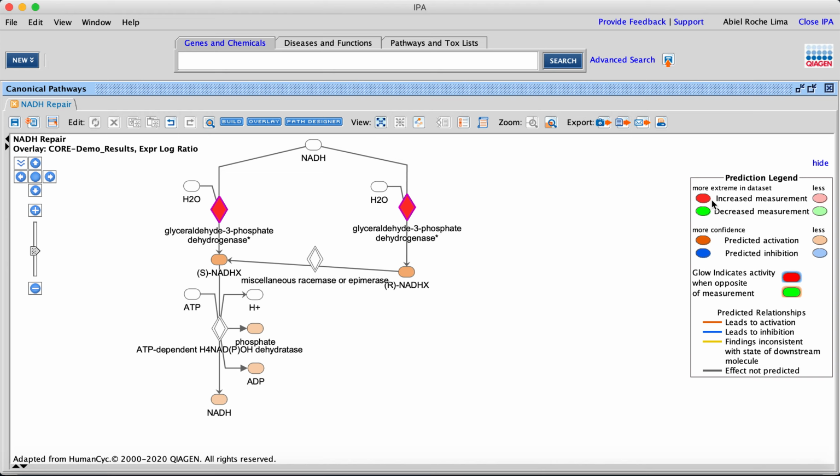So this is the same example. When something is more abundant or less abundant, it will have an effect. But based on the literature, that will have an impact on your results. The results that you are getting may not always be the ones that are in the literature, but they are already reviewed by literature.